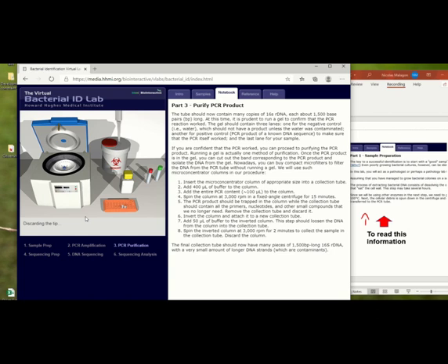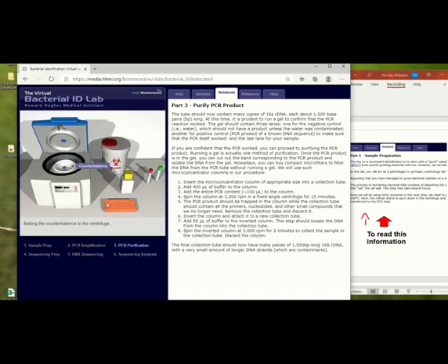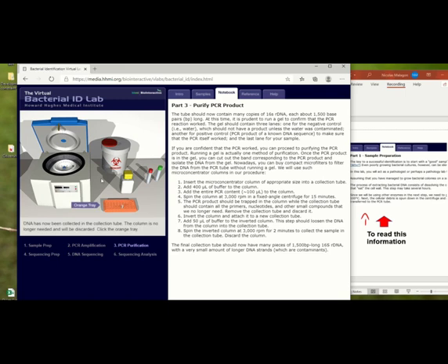So now we're almost done finishing the PCR purification, and this is exactly what you do in the lab. Now we get rid of the extra sections, collect the DNA into a collection tube, and we again go and put it in the centrifuge. We close the centrifuge. We wait a little bit more to separate the different solutions that we have here.